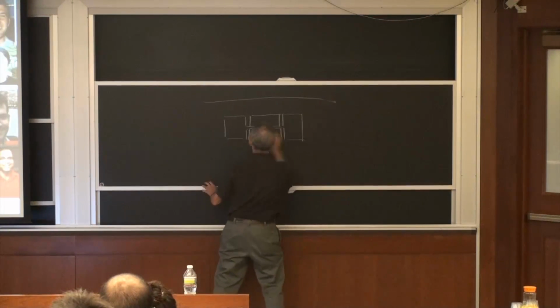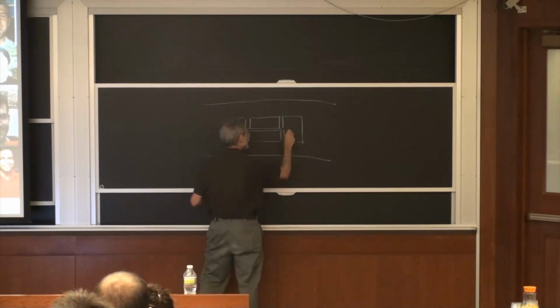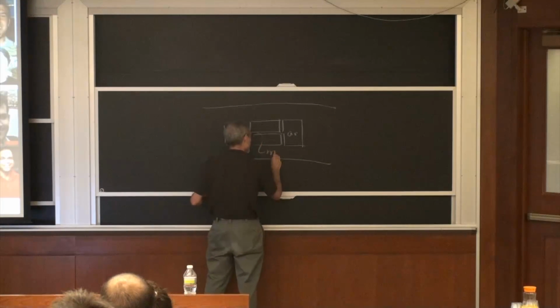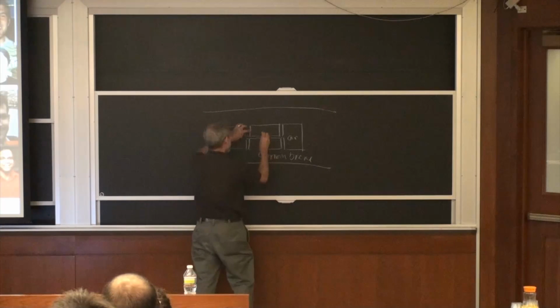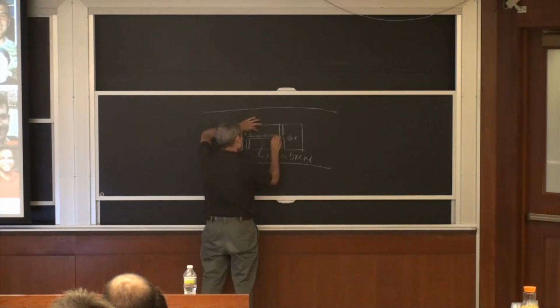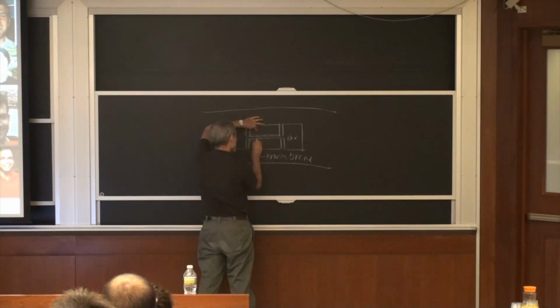Okay, so this is the device. This is air, this is air, this is the thin membrane. They could plate cells on the top here, for example airway epithelial cells or alveolar epithelial cells, and plate a different type of cell down here.